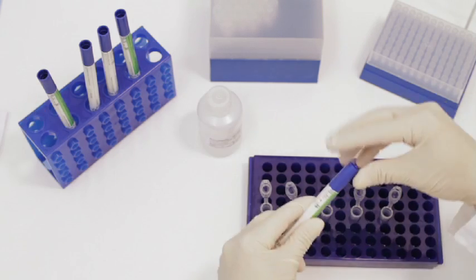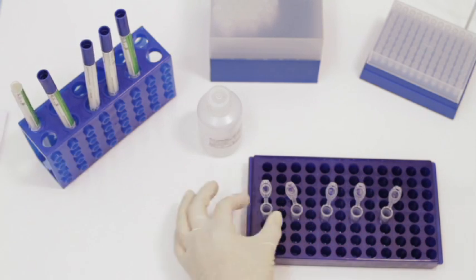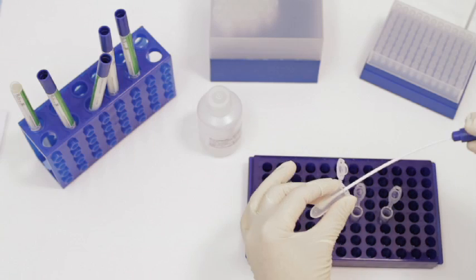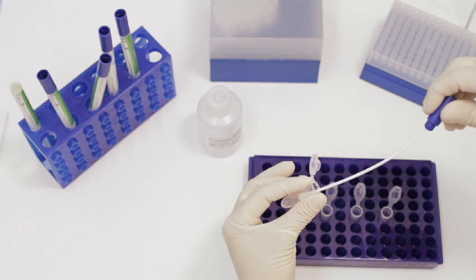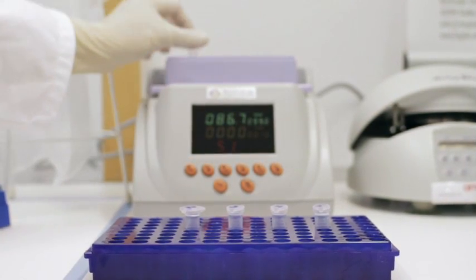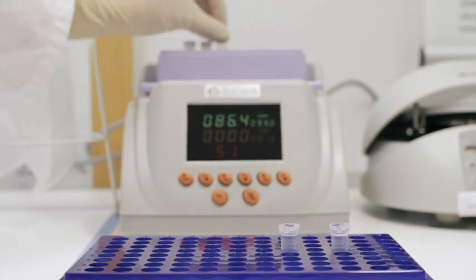Crush the swabs vigorously in 300 microliters of the lysis buffer. Then activate the lysis buffer and perform the bacteria lysis at 99 degrees Celsius for 10 minutes in the heating block.